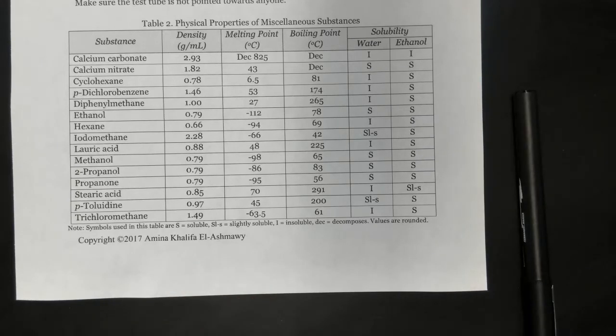Now, what does it mean for it to be soluble? Soluble is when the solid is placed into the liquid, and after you agitate, the solid disappears. It becomes dispersed homogeneously throughout the liquid. The liquid remains clear after the solid dissolves. Okay? There's no cloudiness, no turbidity at all.